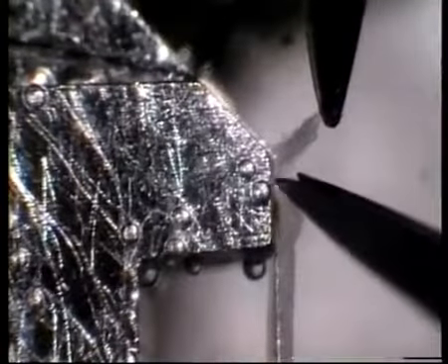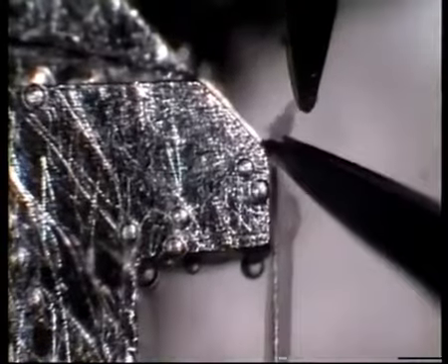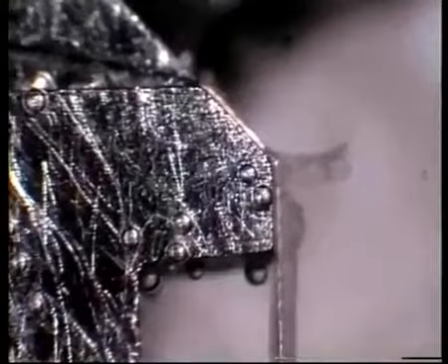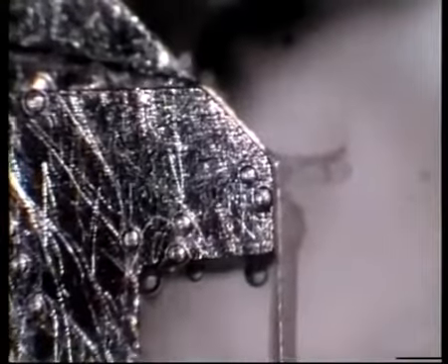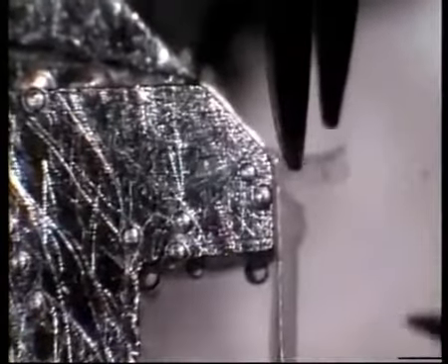To perform this method, you need quality sharp instruments and steady hands. Take care not to pull the vessel longitudinally or to cut the wire. It is important that a part of the vessel is still fixed between the support and the wire in order to hold the vessel in position when you put in the second wire.